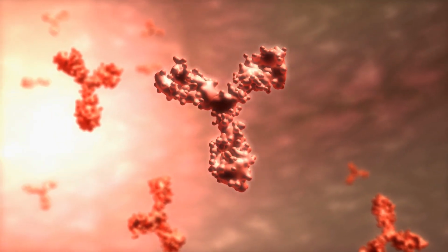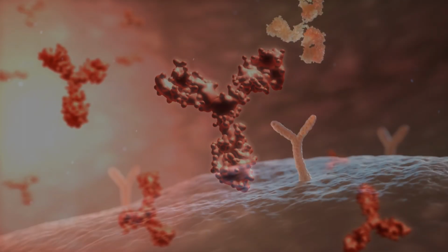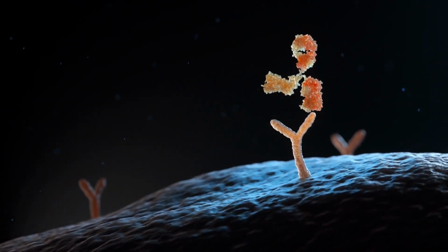3D imaging mass cytometry is an extension of imaging mass cytometry. And imaging mass cytometry is a method that's analogous to immunofluorescence. So similarly to immunofluorescence, this method uses antibodies to target proteins. If immunofluorescence uses a handful of targets, imaging mass cytometry enables the use of up to 40 targets. And this is enabled by metal tag antibodies.